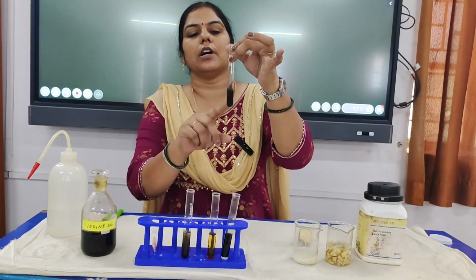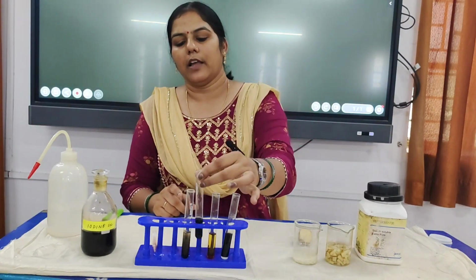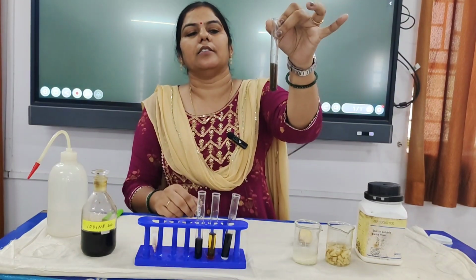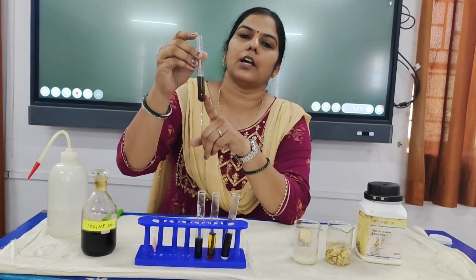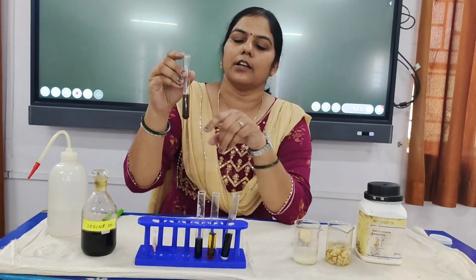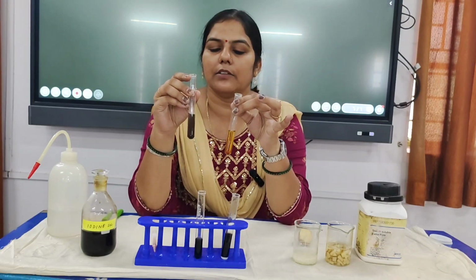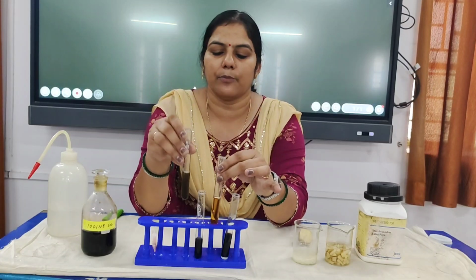And this was the third sample, our rice water. It has clearly turned blue-black, and our fourth tube contained potato water, and this color has also changed to blue-black. However, the presence of starch in potato is less in comparison to the rice water, but we can clearly see the difference in the color of the negative control and our food sample.